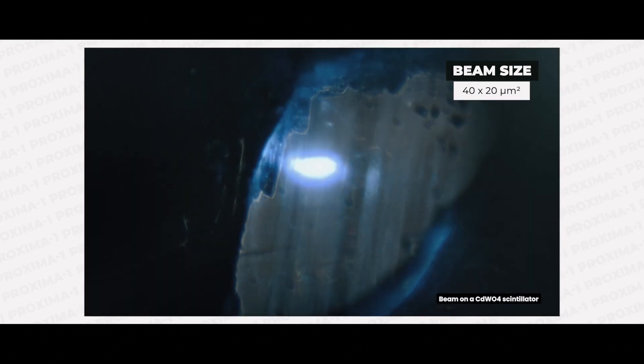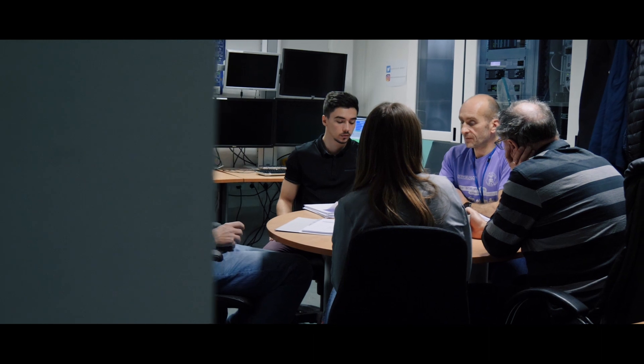The Proxima 1 team is composed of five people: one beamline responsible, an assistant engineer, two beamline scientists and an industrial liaison scientist.